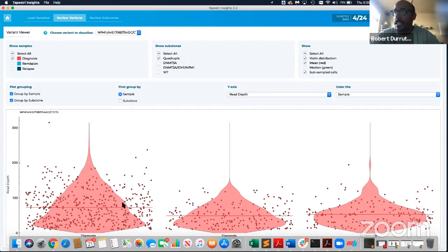And what you can tell is that, similarly to what the quality already suggests, cells in your high quality clone have, on average, about 80 reads, as opposed to the cells that are now part of the C6 and C7 clone, which come back with about, I don't know, 45 reads. So roughly half, which again nicely corroborates your potential hypothesis that you fail to amplify one of the alleles and therefore end up with just half the reads.